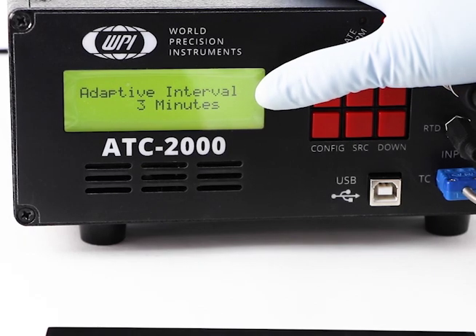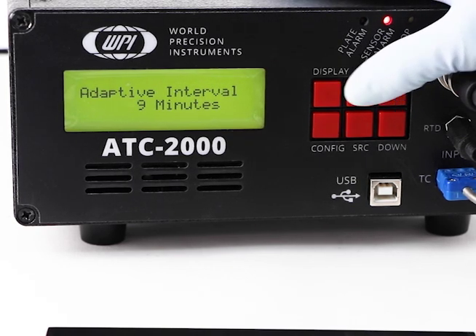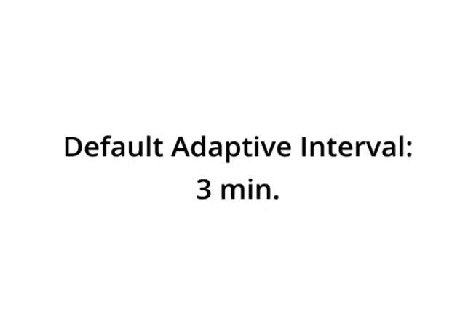The sampling interval for the adaptive mode should be set long enough to allow the subject and the plate to stabilize before the temperature is sampled again. The default sampling rate is 3 minutes.